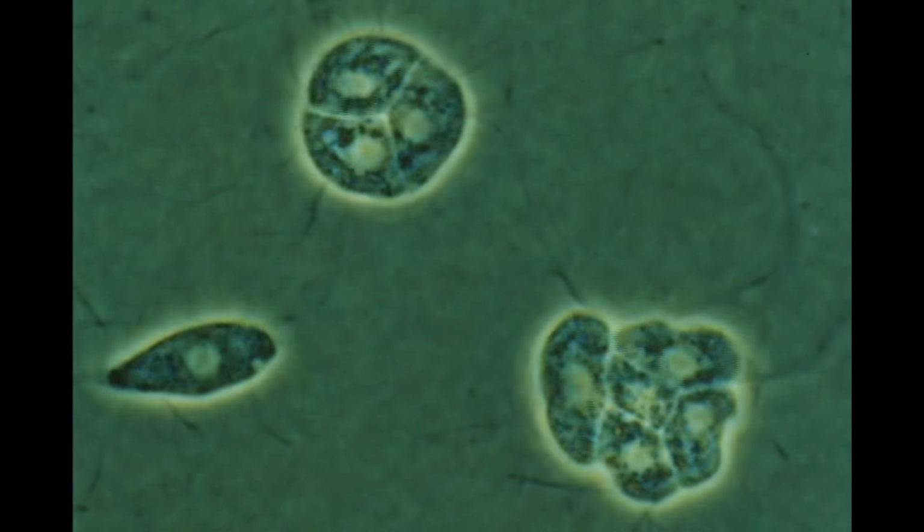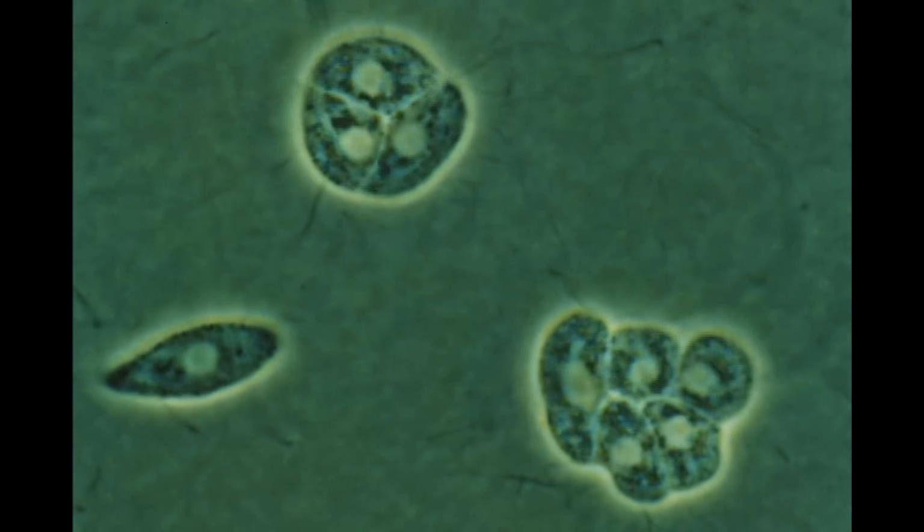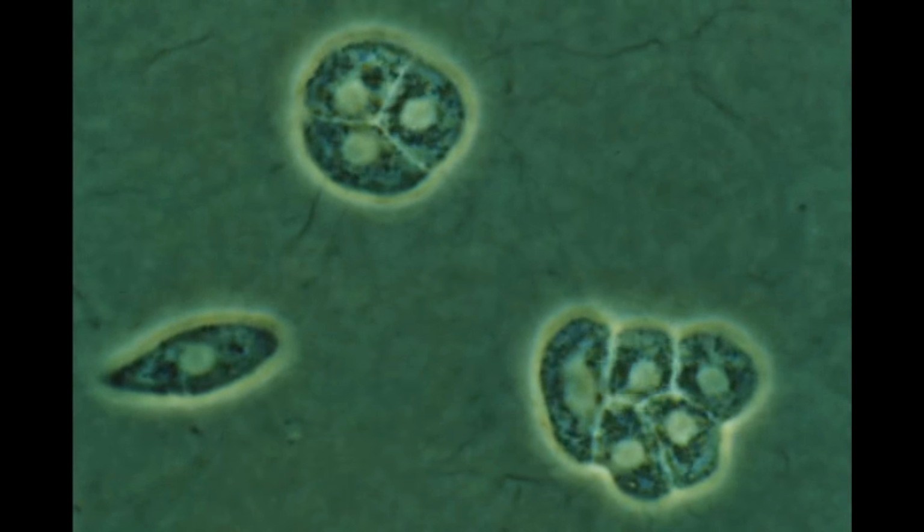In each cell, the prominent central nucleus is surrounded by numerous cytoplasmic granules, mitochondria, and lipid droplets. Another division.